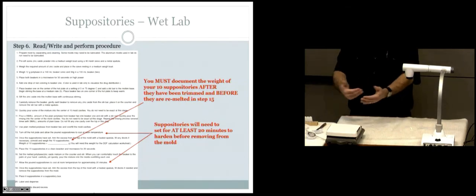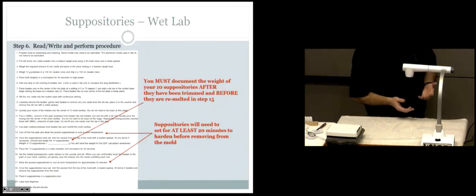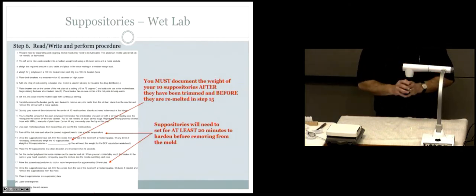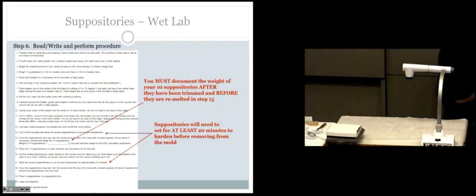And you're going to remove 10 suppositories. They won't be your final suppositories. They're all messed up. You can't use them yet, but they're trimmed to the right weight. So put all 10 of those suppositories on a tared weigh boat and write the weight down. You need that weight to be able to calculate a DDF. So put a star by step 14. Make sure before you remelt those suppositories that you document the weight.